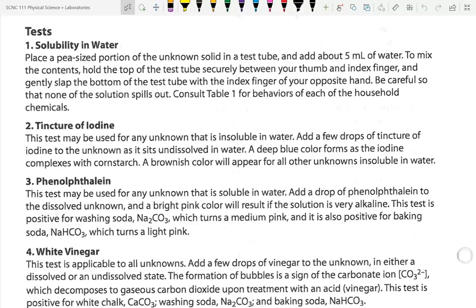Okay. The standard answer is it's a physical change, not a chemical change. But you made me think there when you said, if you talk about salt, does salt dissolve in water? Yes. Salt dissolves in water. So salt is one of our substances, and that's going to be one of our tests. When the salt dissolves in water, what actually happens is the sodiums and the chlorines actually separate. They're no longer bound together. So that would be, at the very least, a chemical change as well.